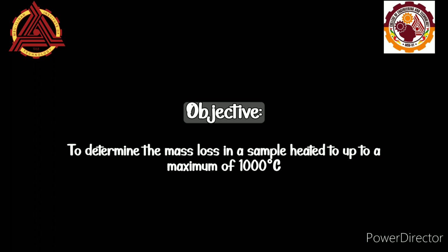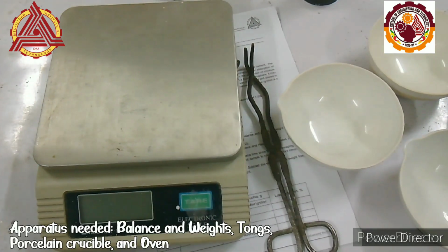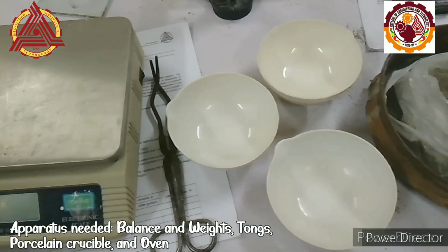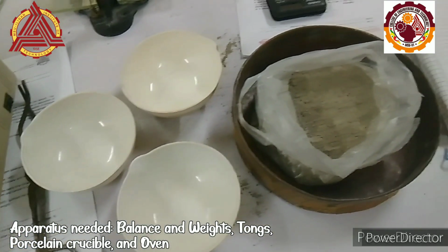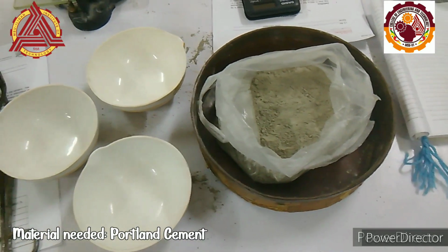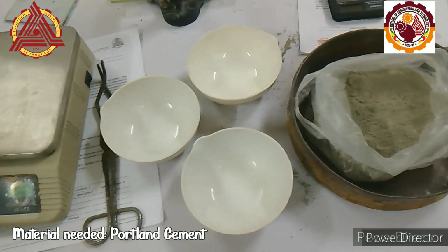The objective of this laboratory activity is to determine the mass loss in a sample heated up to a maximum of 1000 degrees Celsius. The apparatus needed for these tests are balance and weights, crucible tongs, porcelain crucible, and drying oven. The material needed is Portland cement.